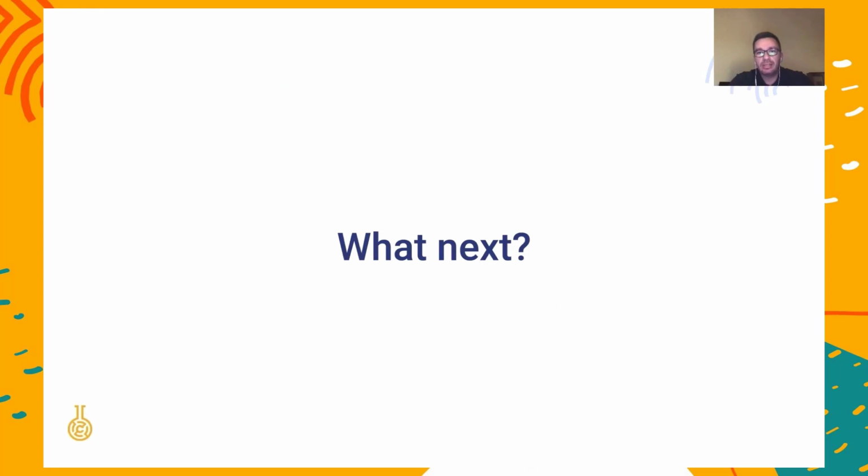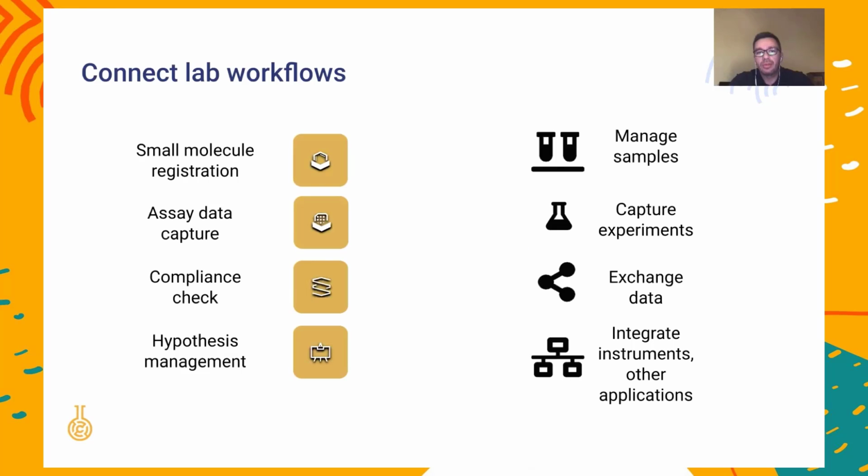So what next besides having the data management and the design steps covered? We have experienced that there are a number of lab workflows that have to be integrated as well, because there's a list of needs like managing samples, capturing experiments, exchanging data with each other, and integrating to instruments and other applications that need to be supported in a way that is connected with all the previous components that I listed before.